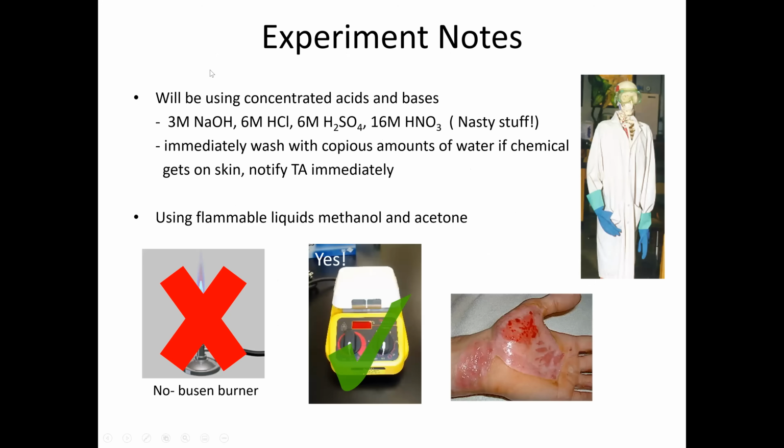And just a few things in this experiment, we will be using concentrated acids and bases. So please make sure you're very diligent in handling these types of acids and bases.